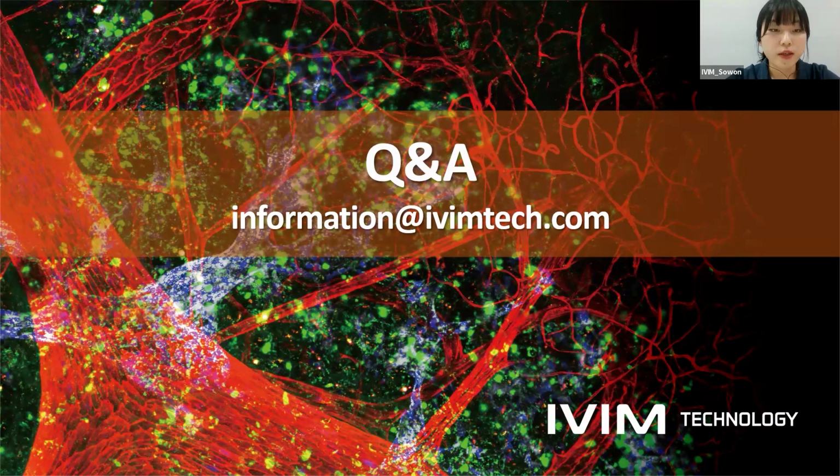So the first question is, how long does the fluorescence signal last when you label the blood vessels? So the fluorescent signals typically last up to 24 hours. And if you would like to image beyond 24 hours, we recommend injecting an extra booster shot. So from the day 2 point, you would inject about 25 micrograms more of the antibodies conjugated with the fluorescent dyes to really maintain that fluorescent signal throughout your experiment.